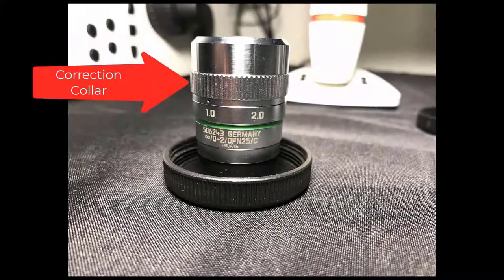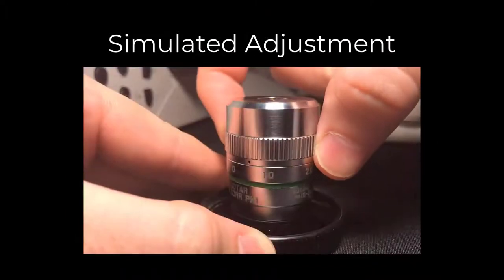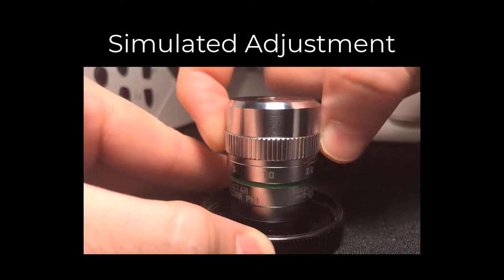The first objective we'll look at is a 20x long working distance objective. The correction collar can accommodate between zero and two millimeters of glass or plastic to be imaged through. Here we see the correction collar being adjusted between the two extremes.